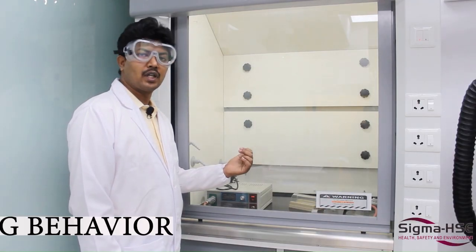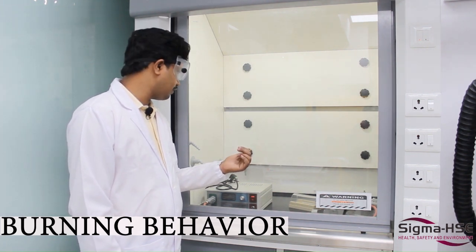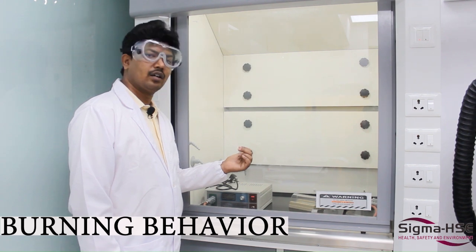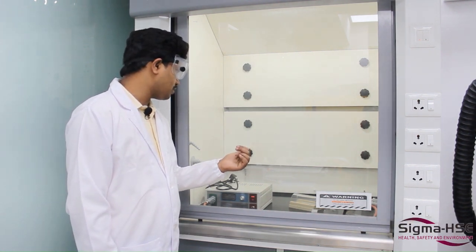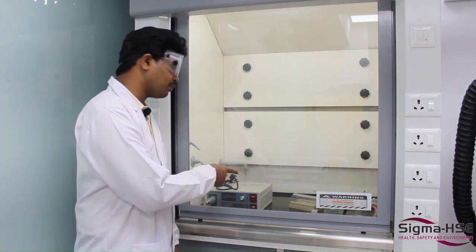This is the other equipment called as burning behavior. This particular equipment determines the fire propagation, flame propagation of the material when it comes into contact with ignition source. Here the ignition source is the platinum wire which gives around thousand degrees C.